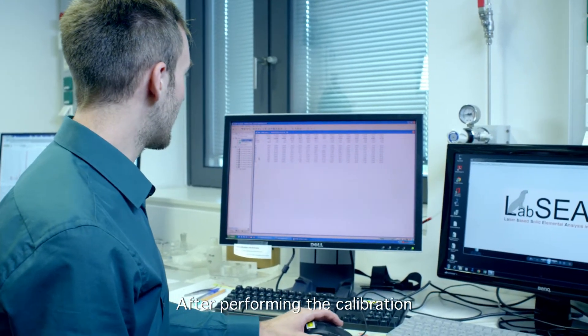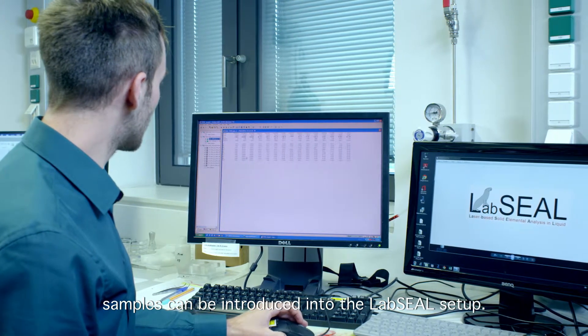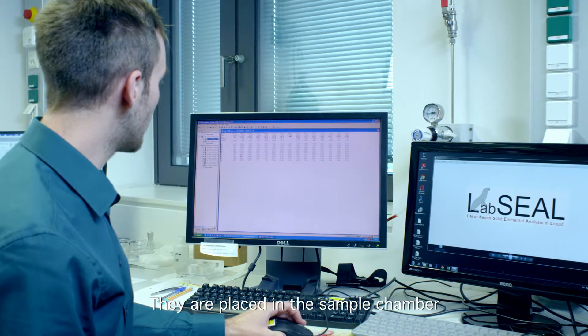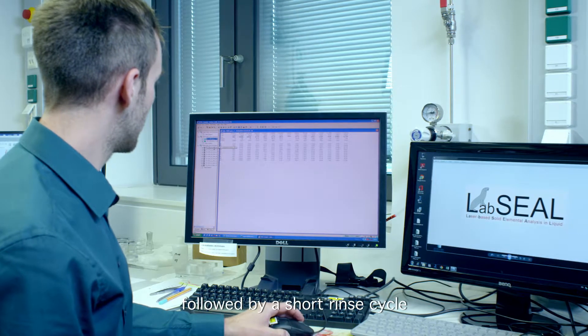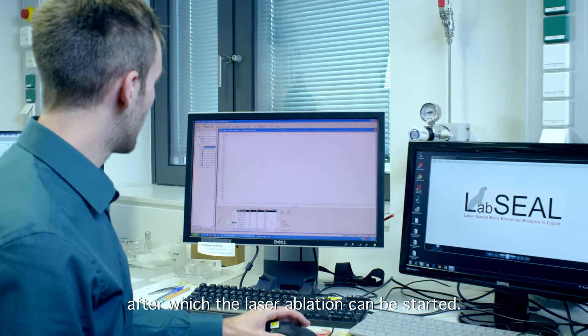After performing the calibration, samples can be introduced into the LabSeal setup. They are placed in the sample chamber, followed by a short rinse cycle, after which the laser ablation can be started.